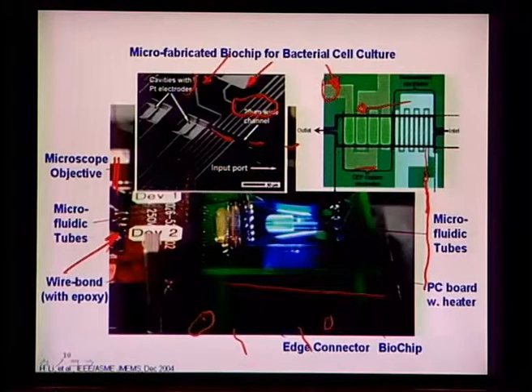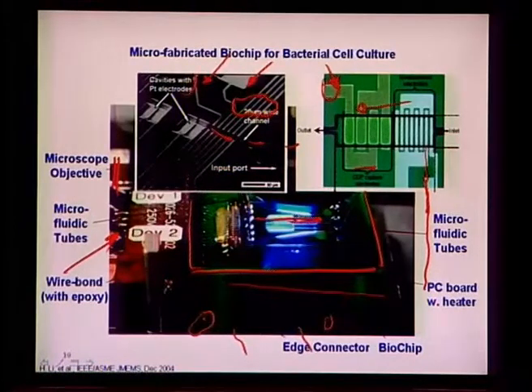microchip, we also saw that there is this PCB green board with embedded heaters around it, and there is of course a serpentine RTD, or resistance temperature detector, which is present on the top of this chip. It is not illustrated here in the images, but it is present on the top of the chip. This is the platinum RTD. The concept is that as the temperature changes, the resistance would change, and based on that you can calibrate the temperature resistance relationship, beyond which you can see what the resistance is and predict what the temperature is and vice versa.